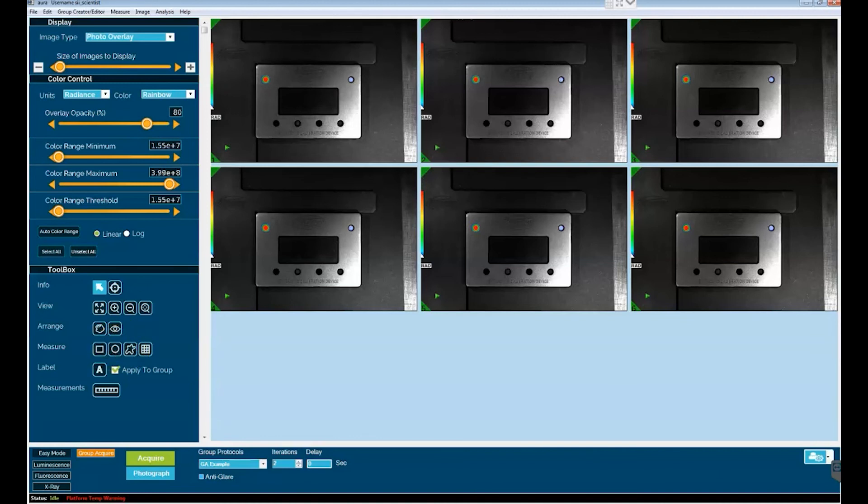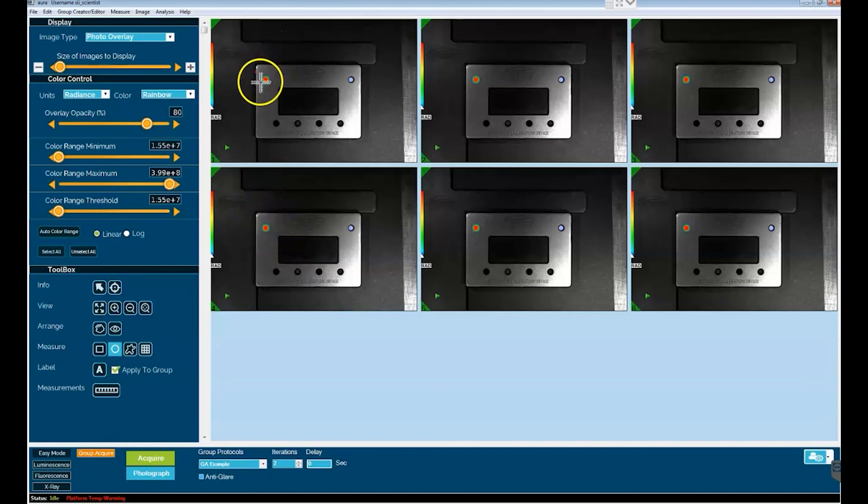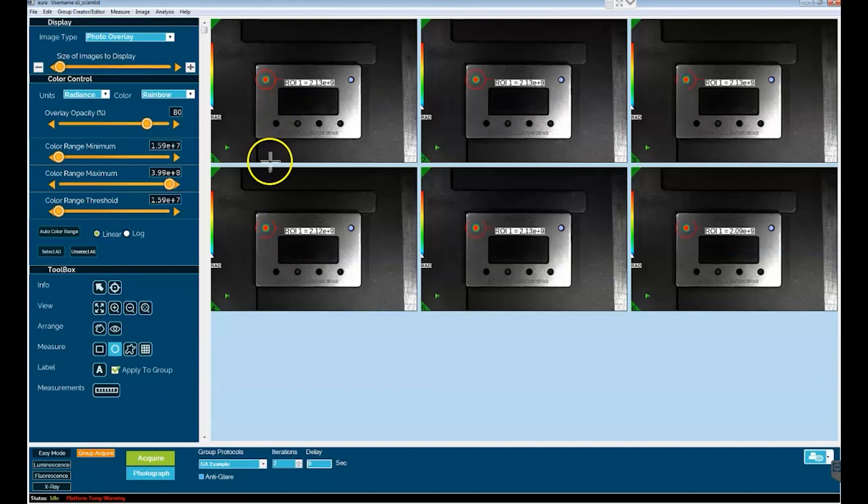So to demonstrate ROI analysis, we will go to toolbox, measure, use the elliptical ROI, and I'm just going to select image number one and draw an ROI. You can see that it is nicely cross applied to all the images.